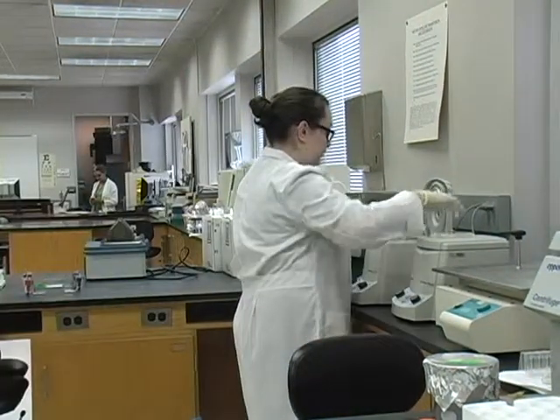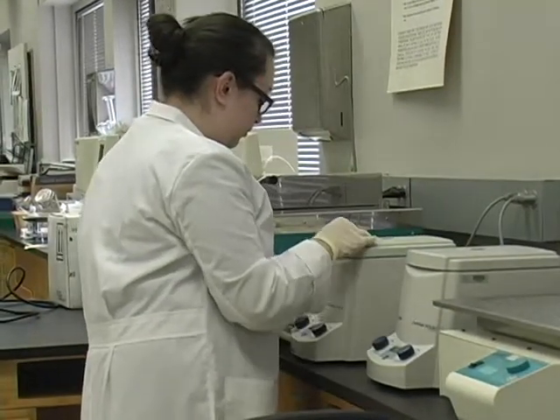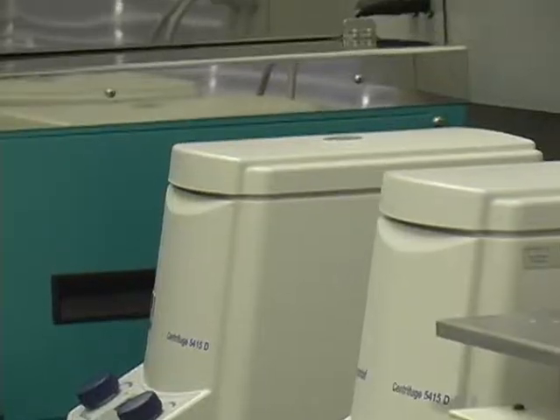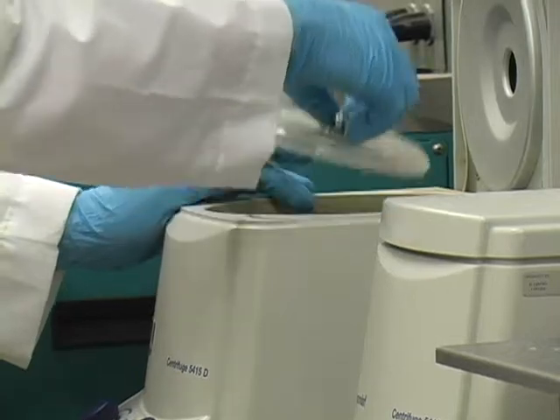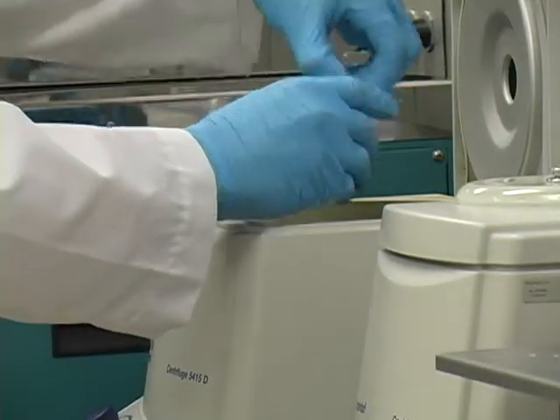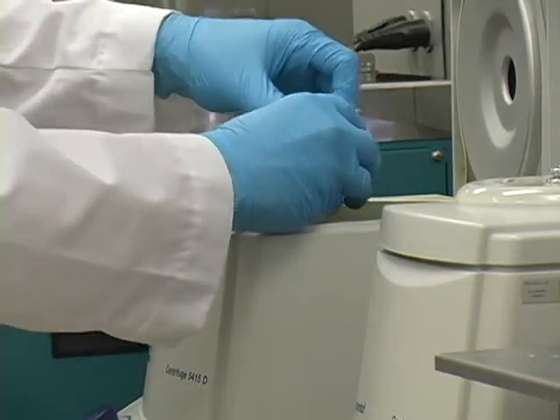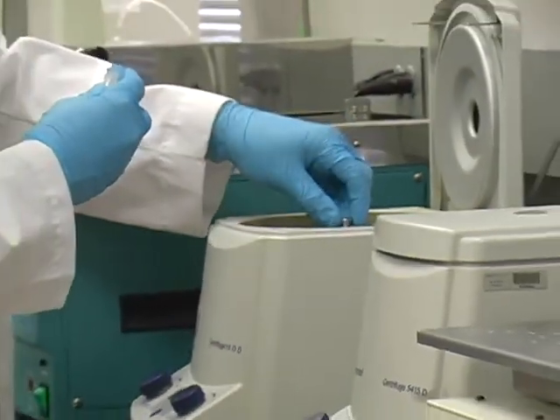They've also taken the plasmid DNA and put it into a bacteria, which is known as a transformation, and that's the only way we're going to get more plasmid DNA because the bacteria is like a factory to make more plasmid DNA for us.